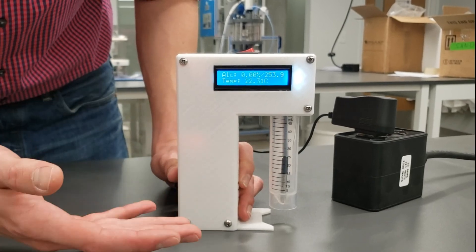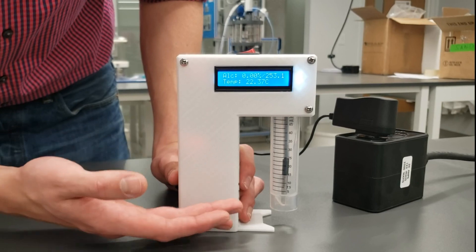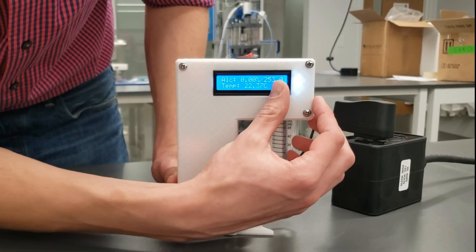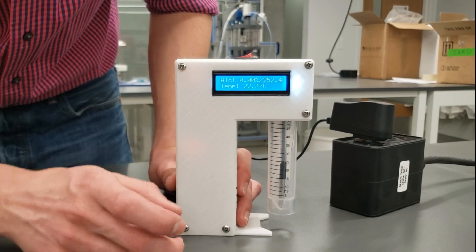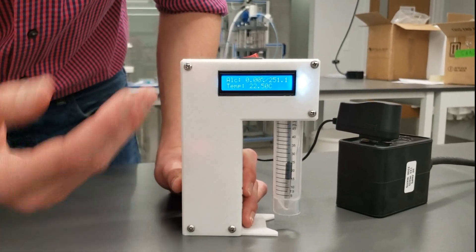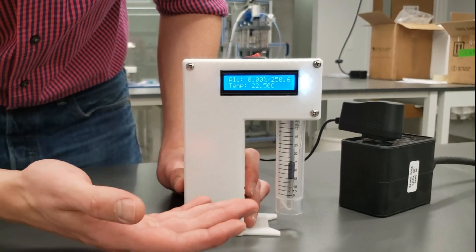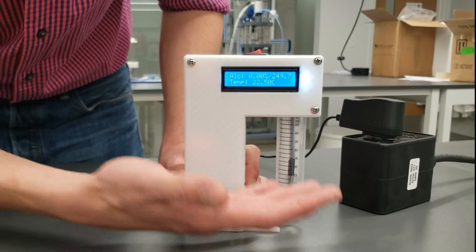However if you want higher accuracy but you're willing to take a little bit more time to calibrate the detector yourself, you can use this raw reading. And I have two separate videos on what I call the easy way to use the detector just using this percentage here and the slightly more difficult but more accurate way to use the detector with this raw reading right here by making your own calibration curve.